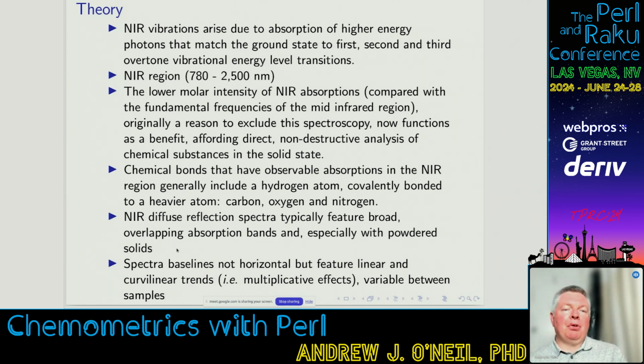For the spectroscopy that I've been doing and presenting on here, the spectra mostly take about 8.3 seconds to acquire. And from that, you can work out what a product is made of, or how much of a particular analyte, such as the drug, is actually present in the sample. And that can be done within about 8 seconds.